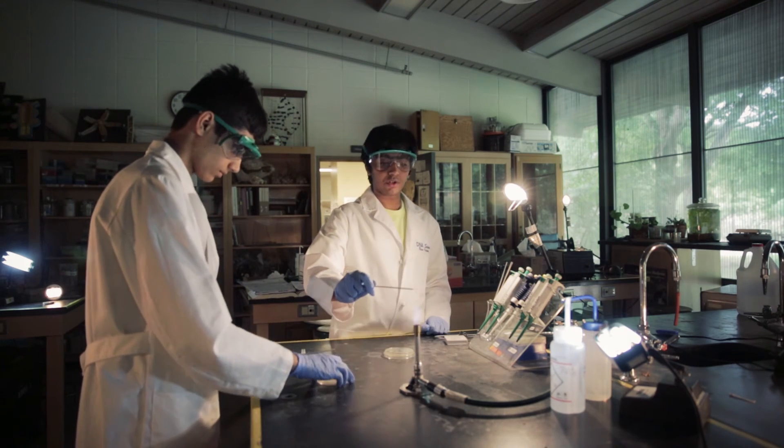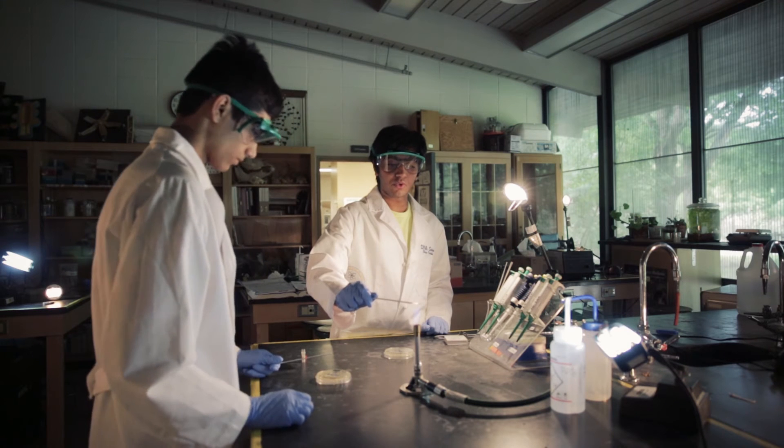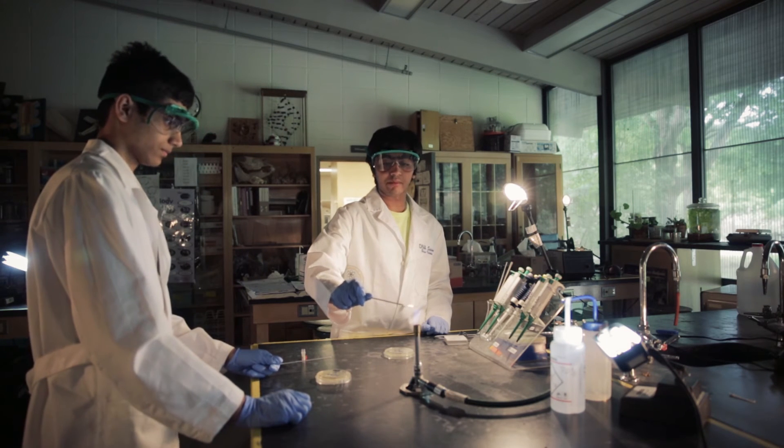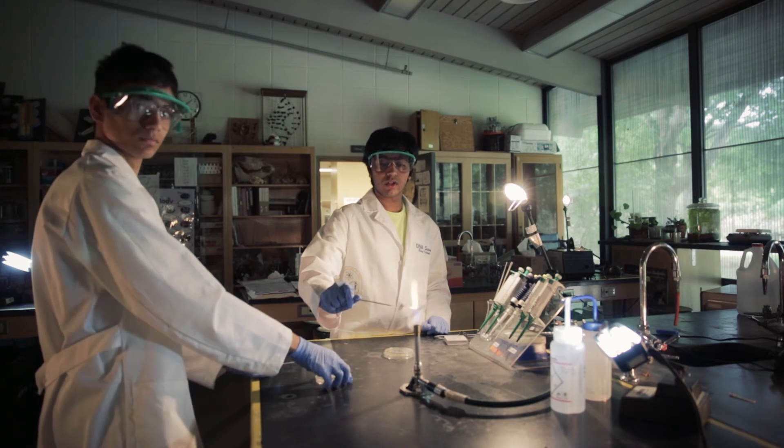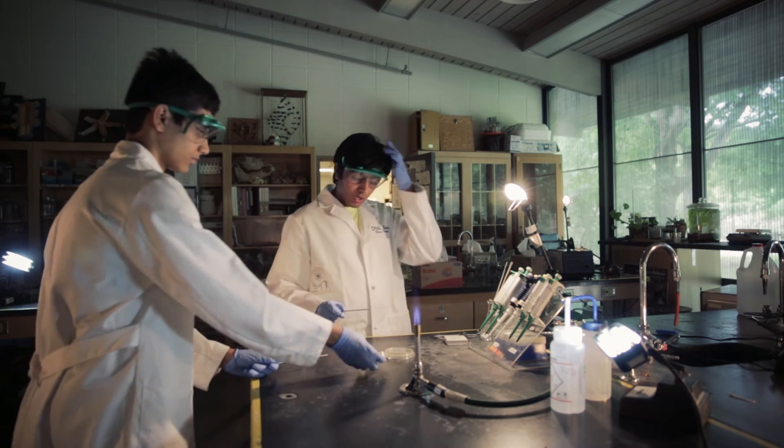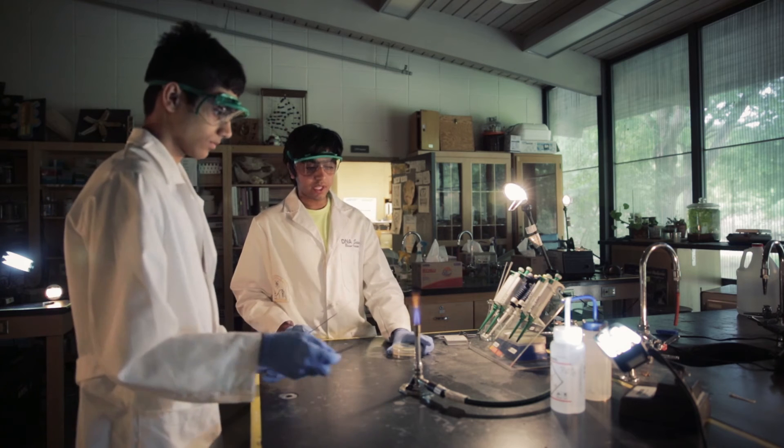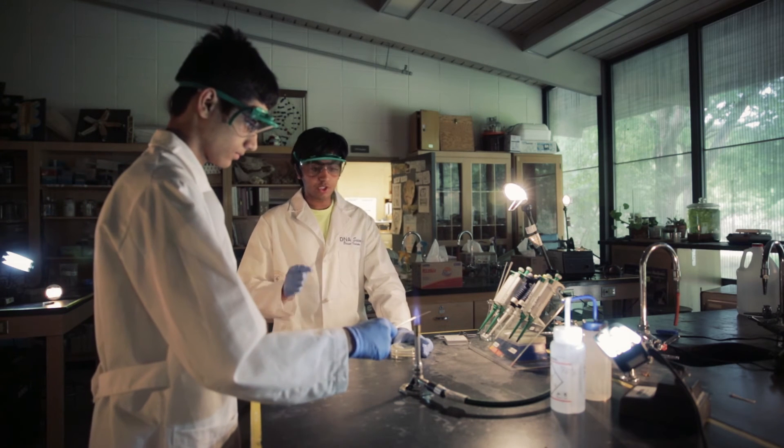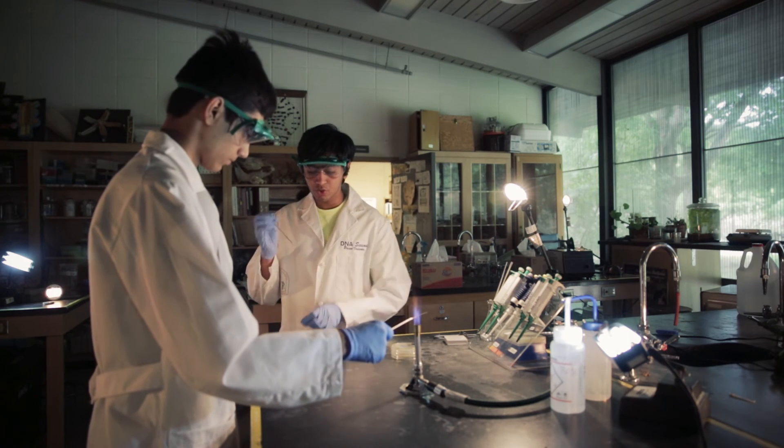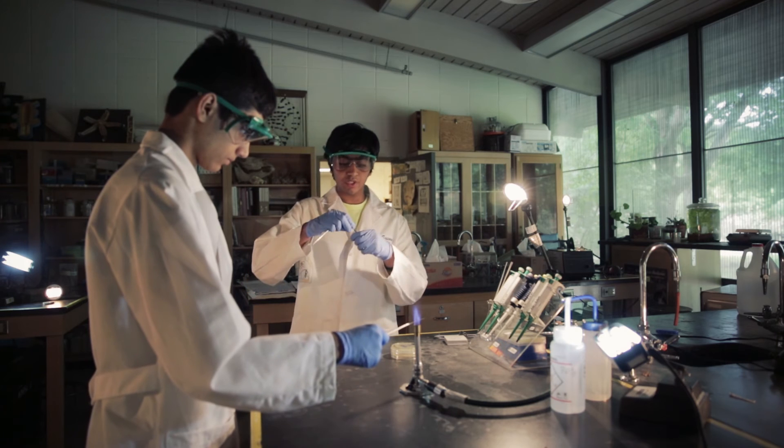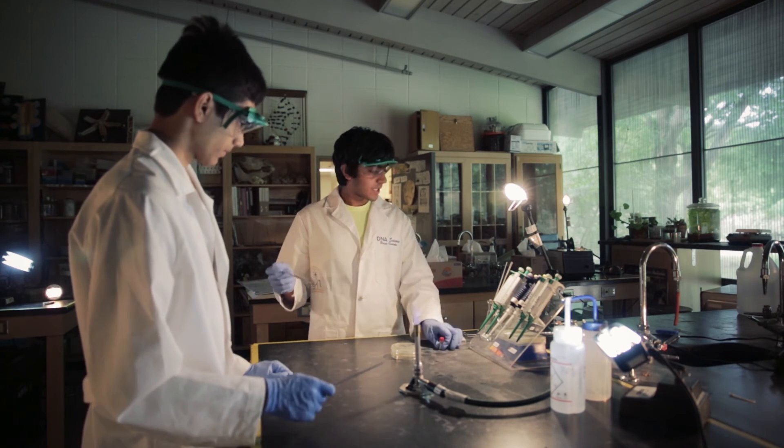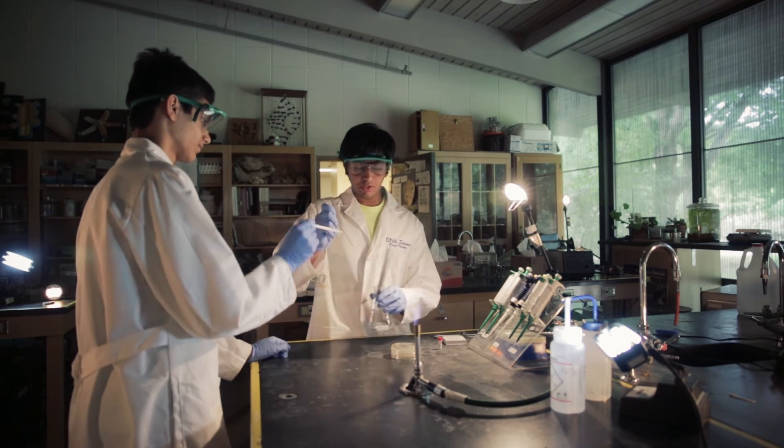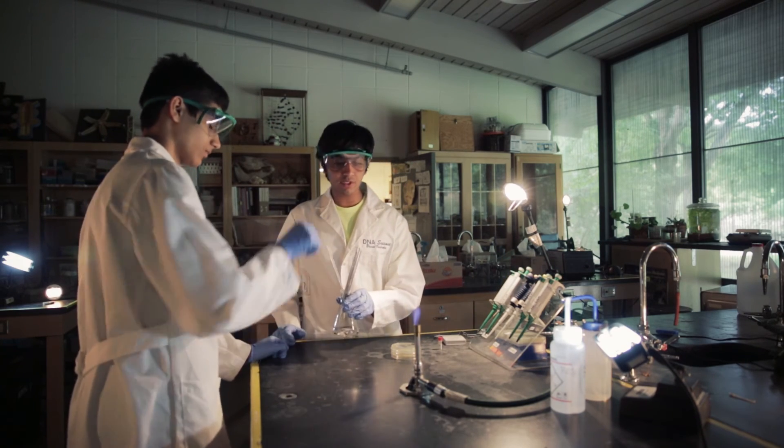And one more time, you make sure your loop is sterile. So you flame it one more time, same way. And if you're streaking any more plates at that time, then you can just put your loop into another one of these vials and take out more bacteria. Or if you're done, then you can just put these back in the bleach solution and let them stay there until next time.